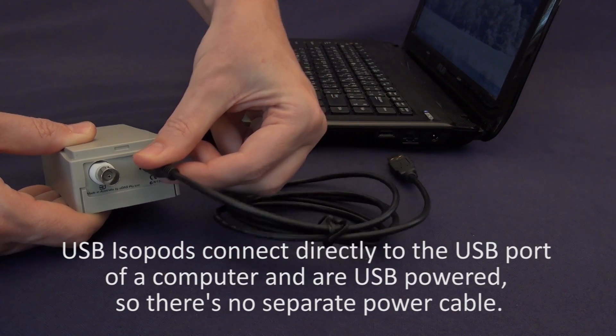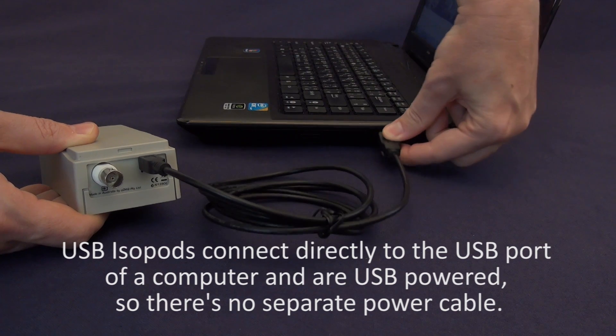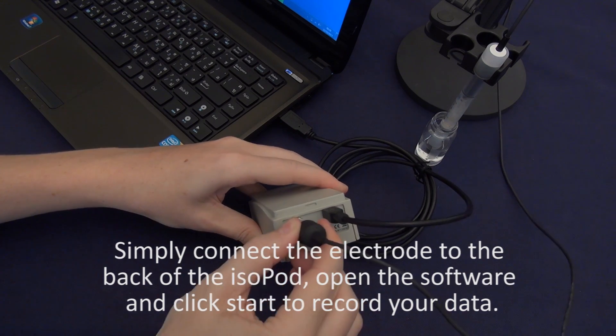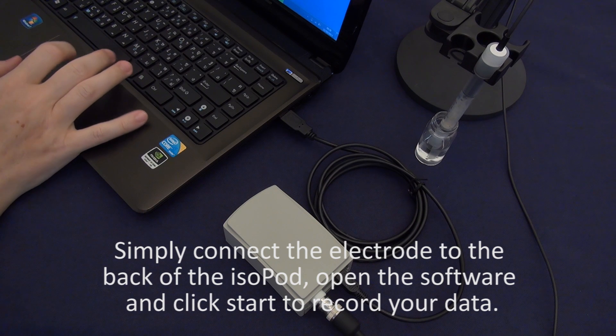USB isopods connect directly to the USB port of a computer and are USB powered, so there's no separate power cable. Simply connect the electrode to the back of the isopod, open the software, and click start to record your data.